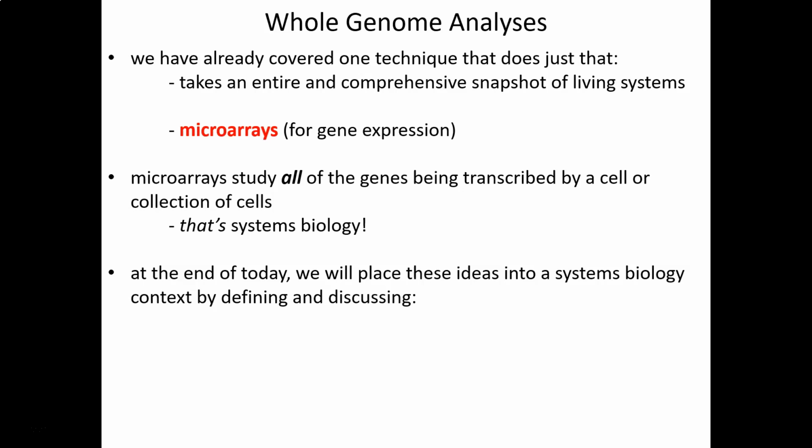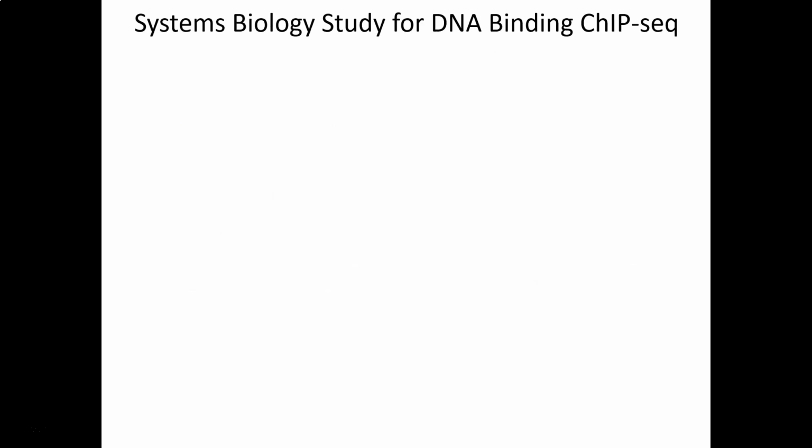And when we end this lesson, we'll also give greater definition of systems biology as a discipline. We'll talk about the genome, which is really the first systems biology concept even before systems biology existed. And then we'll talk about more recent innovations or considerations, more recent concepts, such as the transcriptome, the proteome, and even the interactome. All right, so let's return to ChIP now, but modify ChIP so that it fits a systems biology approach for studying DNA binding across the genome.